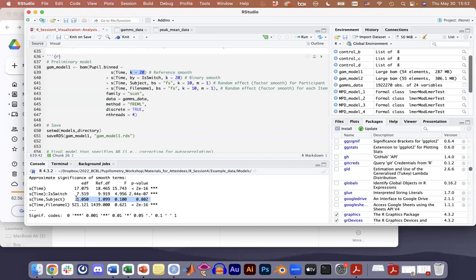Okay, so instead, you might think of dropping that. So would you compare models the same way you do it with linear mixed effect models? Yes, this is a great question. You can do model comparisons with GAMs, and I would recommend it.